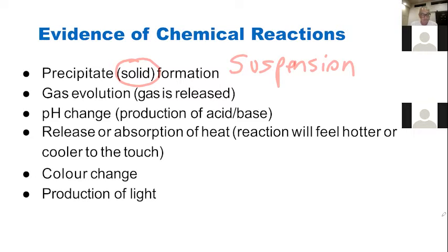Oil and water. Oil and water when? Because oil and water separate from each other, right? And oil floats on the top. But it can make a suspension. When is it a suspension? When it's emulsified, yeah, that's also a suspension. It just basically means that you have small particles in solution that generally aren't soluble in that solution. And tonight, hopefully, fingers crossed, we'll be able to make a solid suspension.